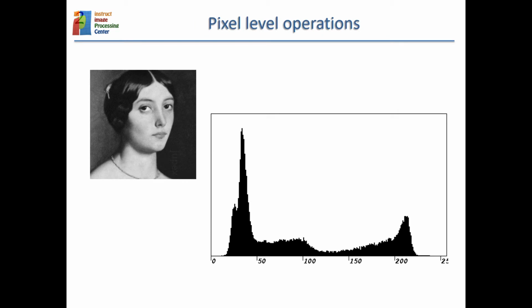And then we can, so we have performed operations at the level of matrix. Now we can perform an operation at the level of pixels. So it would go just to the other opposite side of the kinds of operations we can do. So let's say that when you have an image, this is a matrix of numbers, you count how often you see each one of the numbers.